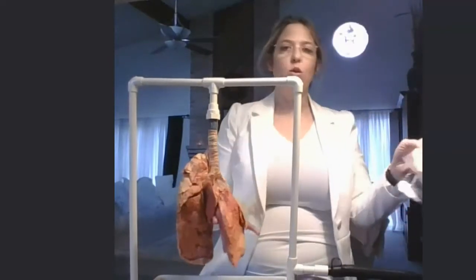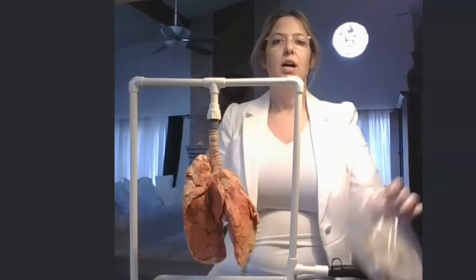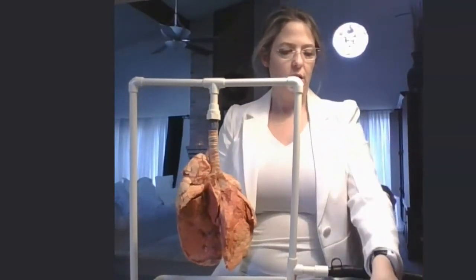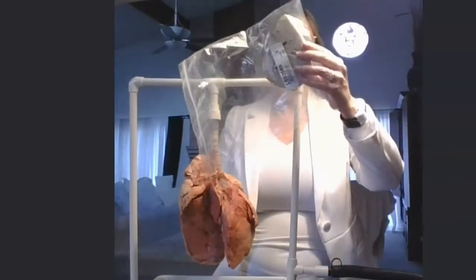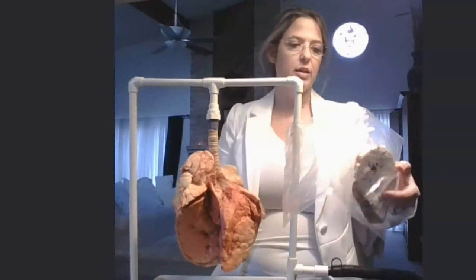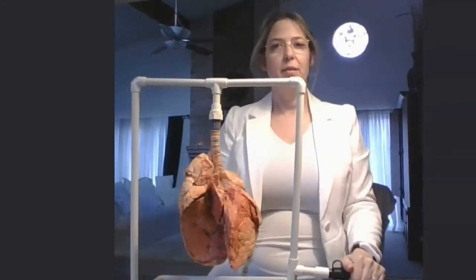Also, there may be a cross section, a cutout of lungs in a plastic bag. Please keep those in the plastic bags. That's for you to see the holes where the bronchial tubes pass through the lungs, but this is very delicate and should not be taken out of the bag.